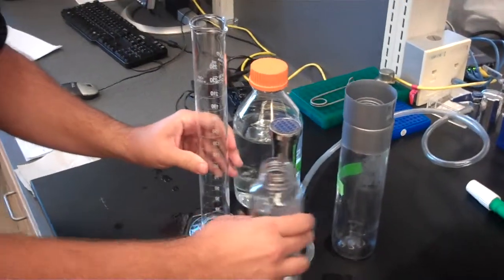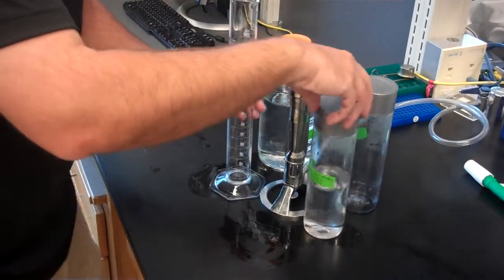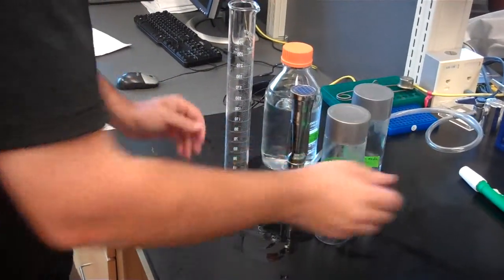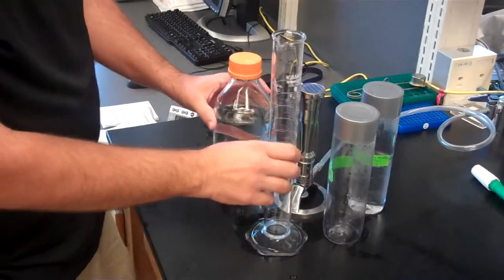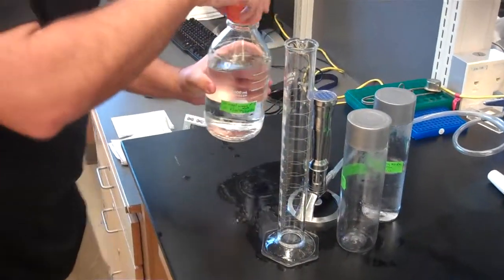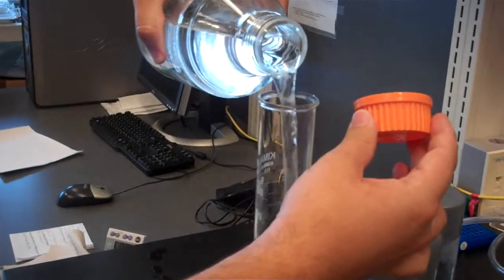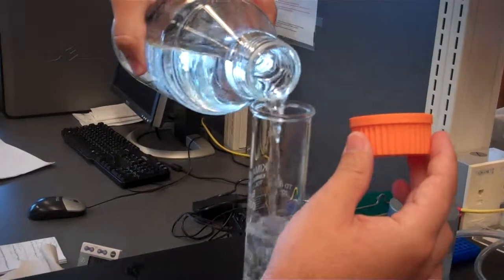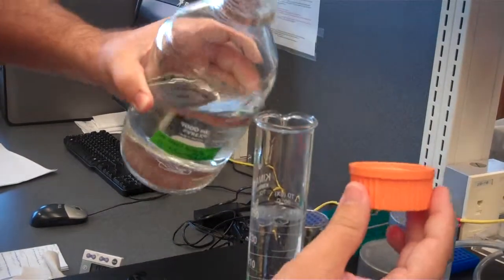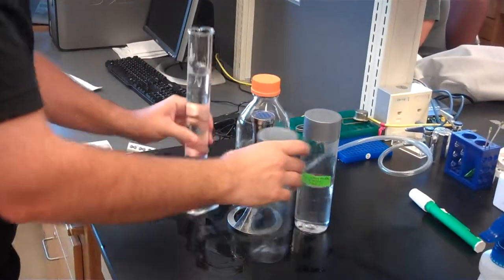Okay, keeping my hands in the sterile field, I'm going to slide that over, put the cap back on. Then I'm going to switch the other bottle in front, put that in the back, and then move this to the original position. Again, turn the number so that you can read it. Keep your hands in the sterile field. Get the meniscus on the bottom. Slide that to the back. Move this forward.